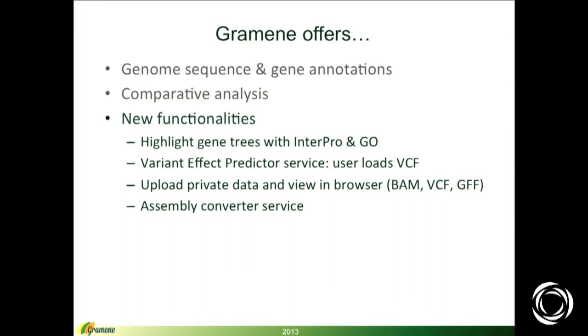You're also now able to upload your own variation data and obtain the variant effect, the functional effect, whether these allelic variants cause a stop codon or missense mutations, that kind of thing. There are others that are not shown clearly in the video. You can also upload your own data sets and visualize them on the genome browser in various formats.